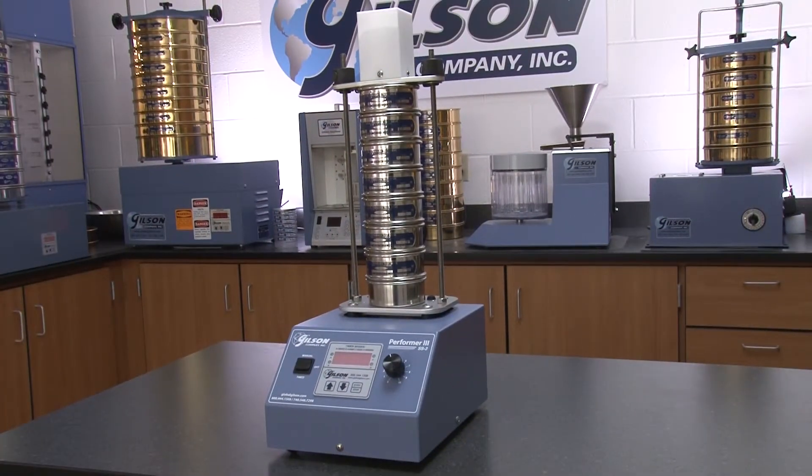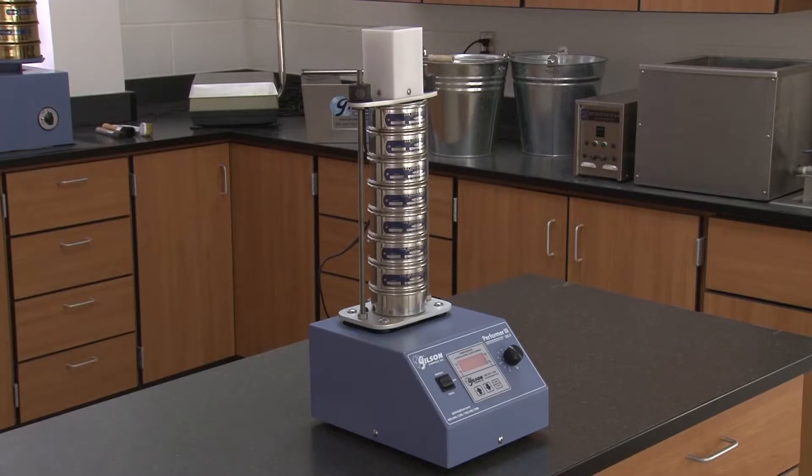Its compact size and lightweight make the SS3 fully portable for convenient positioning within the lab.